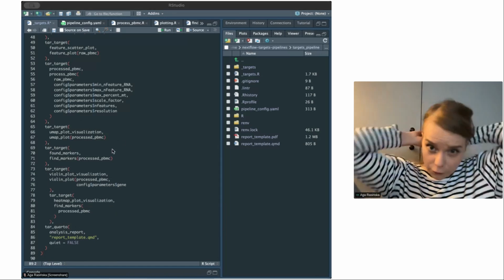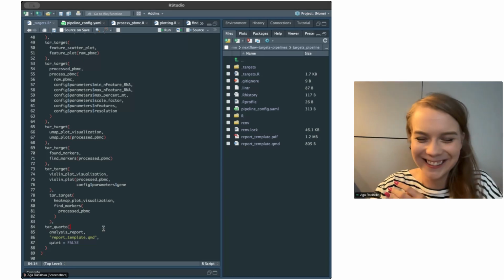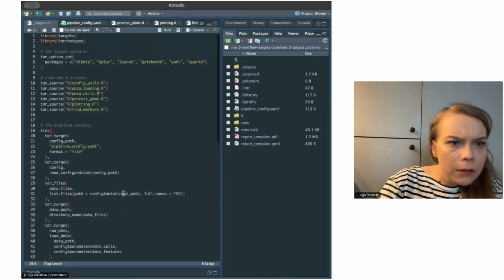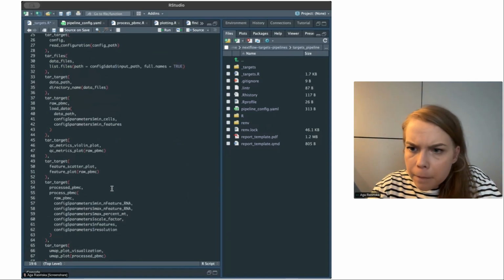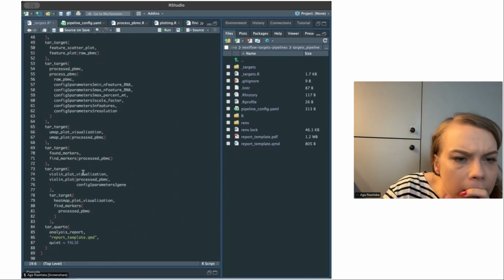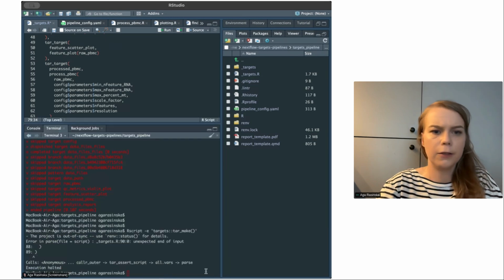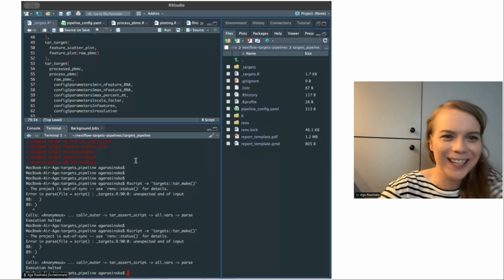I love it, but if you see something that I don't see, you can always help me out. It isn't matched. Target is like 73. Yeah, here. Yes, it has. Yeah, right now, I guess it's good. Thank you, Alvaro, for helping me out with that. Always a help. Oh, no.